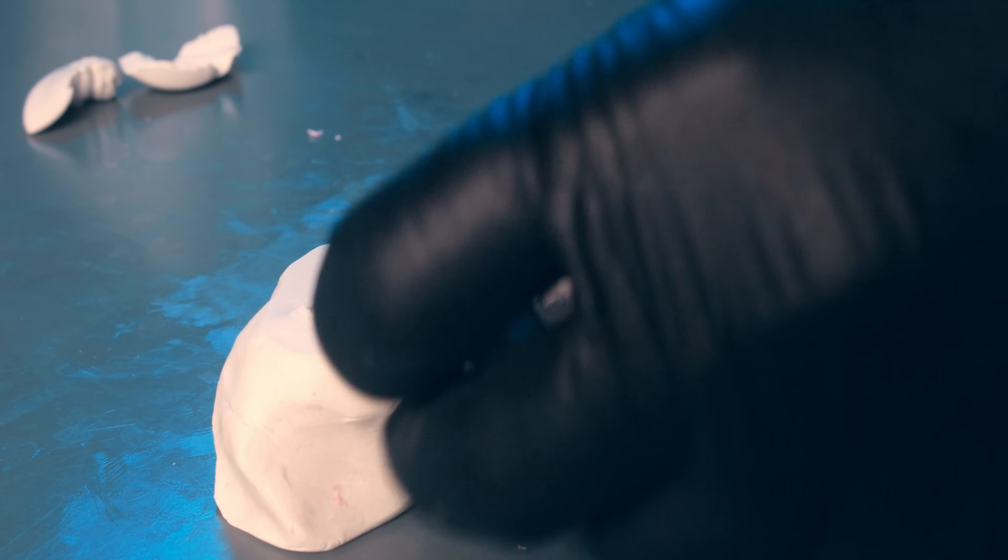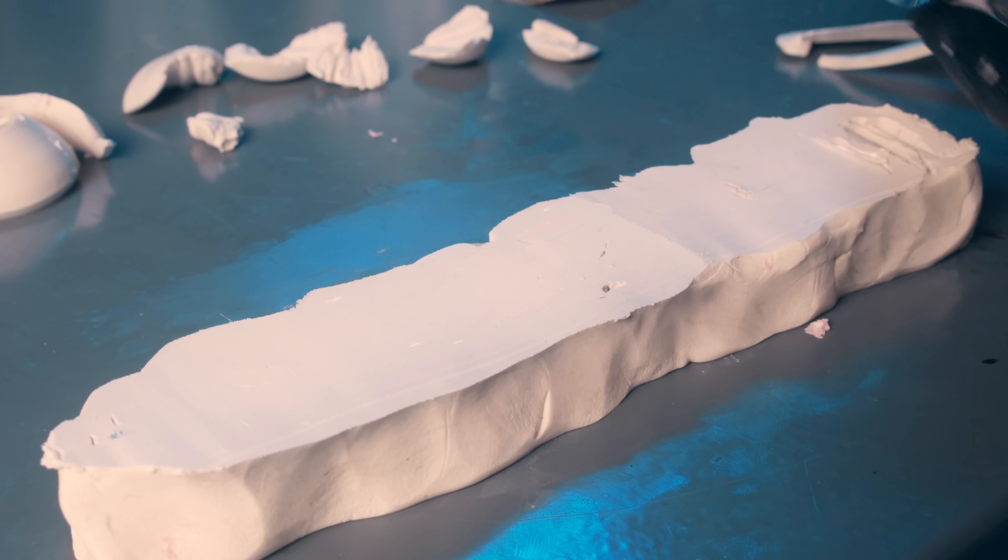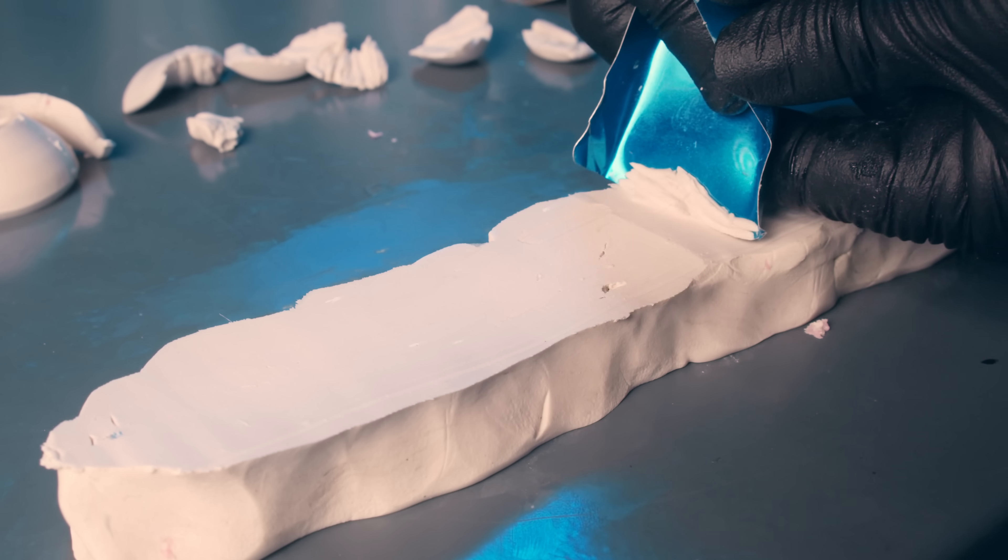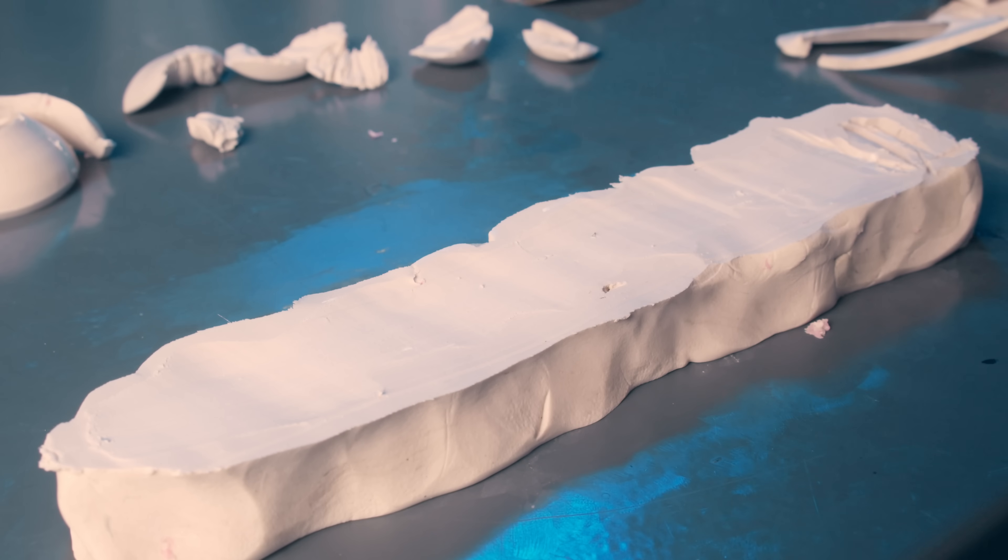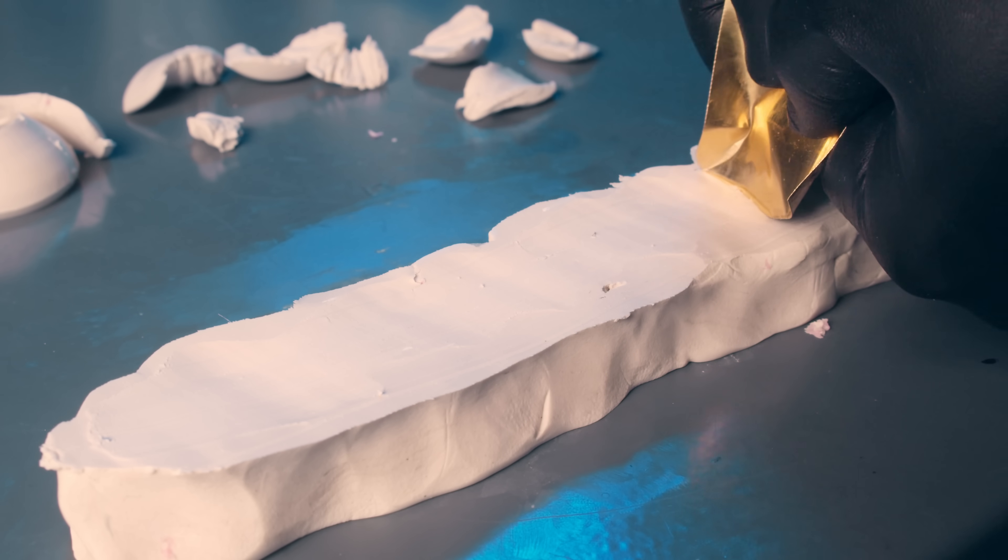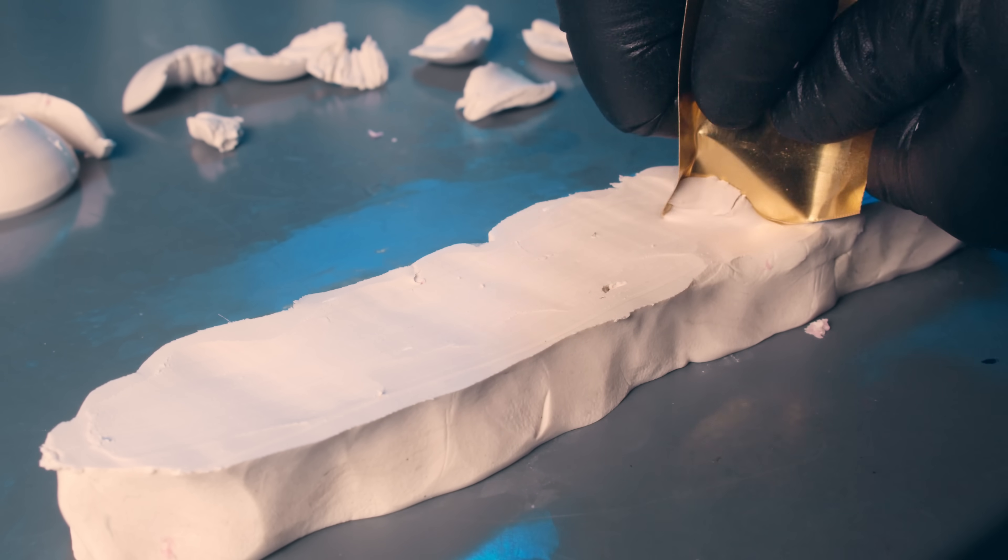This is a useful property because it helps get the material out of the way. You want it to form tight little curls that are easy to break off and don't get gummed up at the cutting edge. If you have a tool that has a flat cutting surface like this one, you can see that the material just sort of piles up on the face of the tool and doesn't really go anywhere. It kind of gets stuck. So those little bumps and creases are almost as important as the actual edge that's doing the cutting. So there's a lot of finesse into the geometry of these cutting tools.